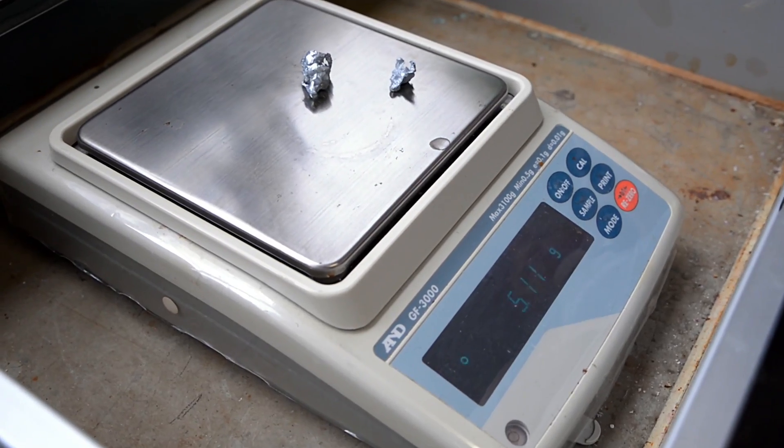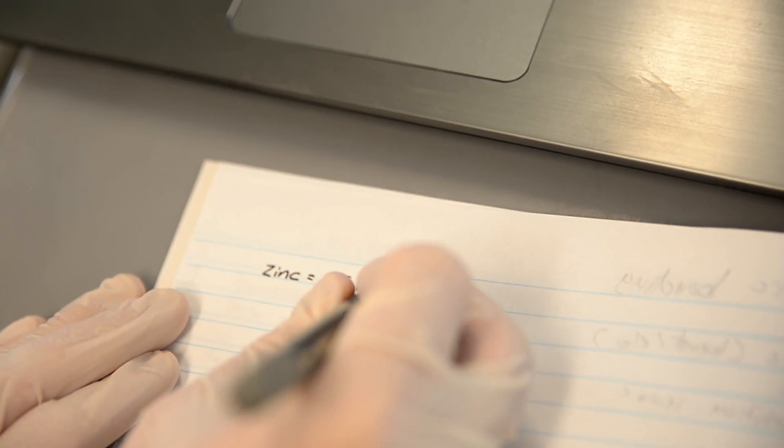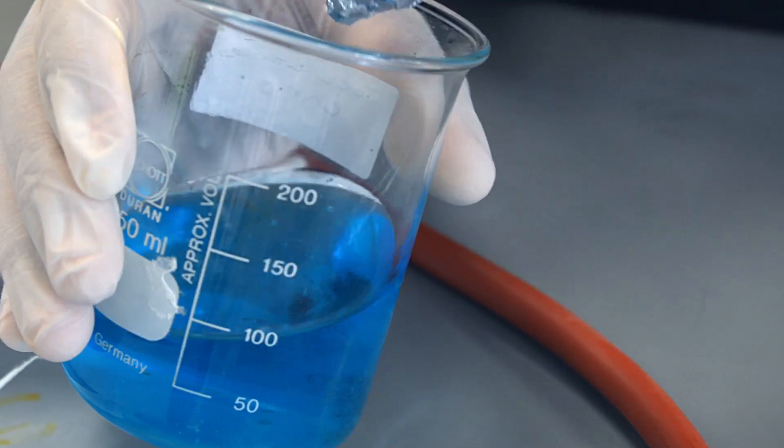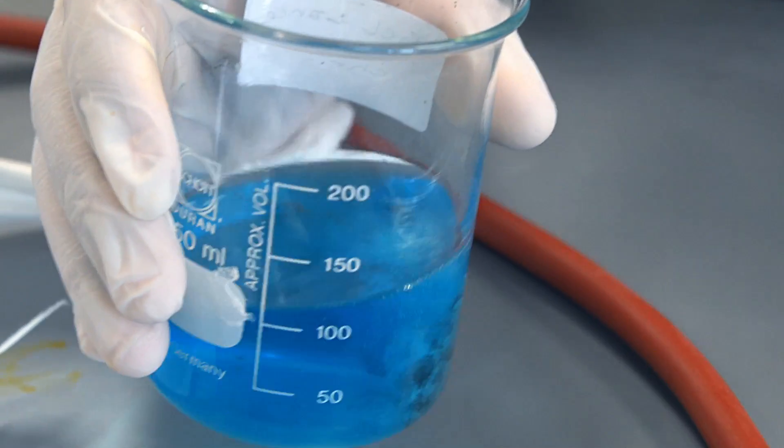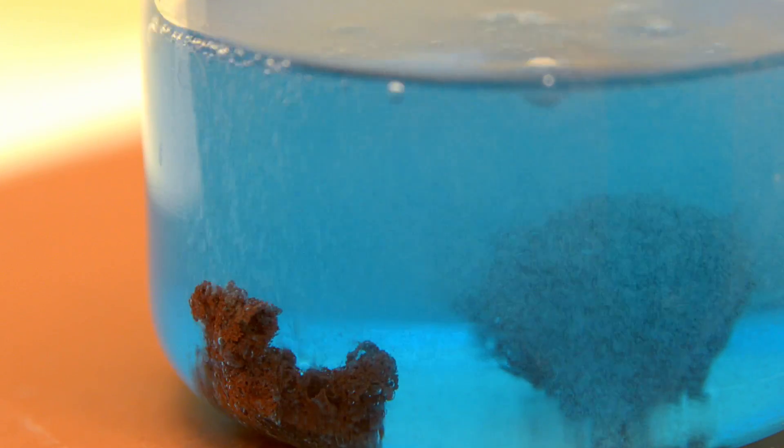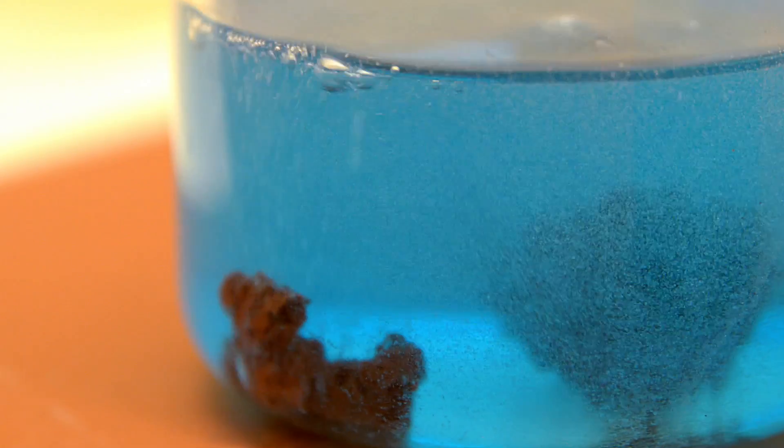We then measured out roughly 5 grams of zinc and added this to our solution. This produced a gas, so we put it into the fume hood with a watch glass on top. This reaction took a long time, so we left it in the fume hood overnight.